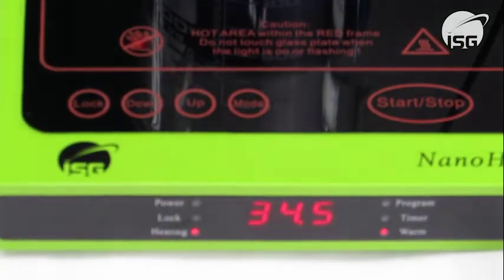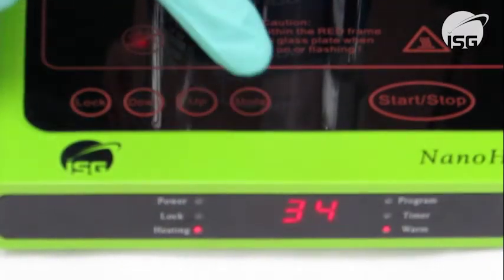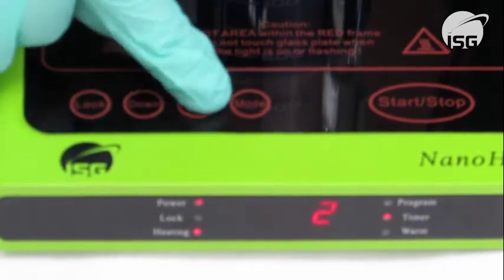This hotplate has four heating modes which are selected by pressing the mode button then the up and down keys to select the desired temperature. Press the start key when you wish to start heating.